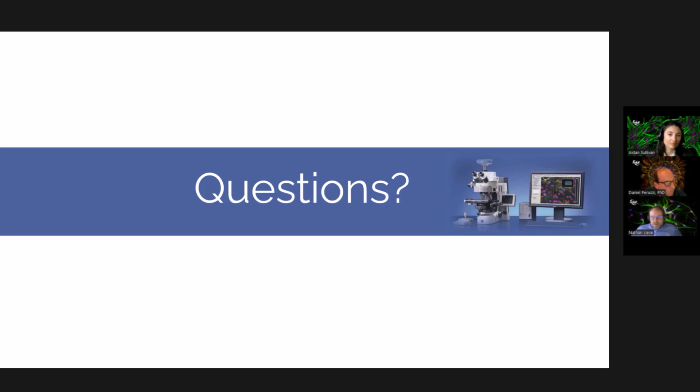Yeah, so we've got a question about sectioning the tissue and how thick that should be. The question is, I may have missed this, but does tissue fixation and sectioning thickness affect the pilot study? In other words, what if we sectioned at 35 or 40 microns? So it's a really good question. We get questions like that very often. I'm going to take a stab at it here and jump in if I leave any holes.